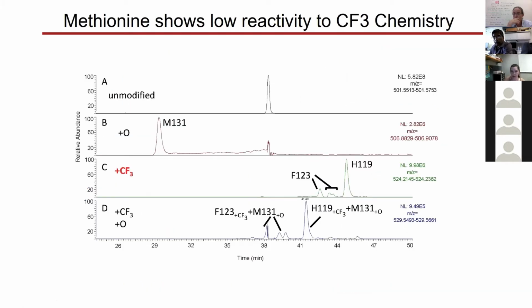So this is exactly the same chromatogram, but now it's not superimposed. So here is the methionine extracted for +16 Dalton shift. And you can see there is no other labeling, because methionine typically gives all this bad tailing, so you cannot resolve any peaks for other residues, even if they exist there. But most of the time, methionine really mutes labeling of other residues because it's so reactive.